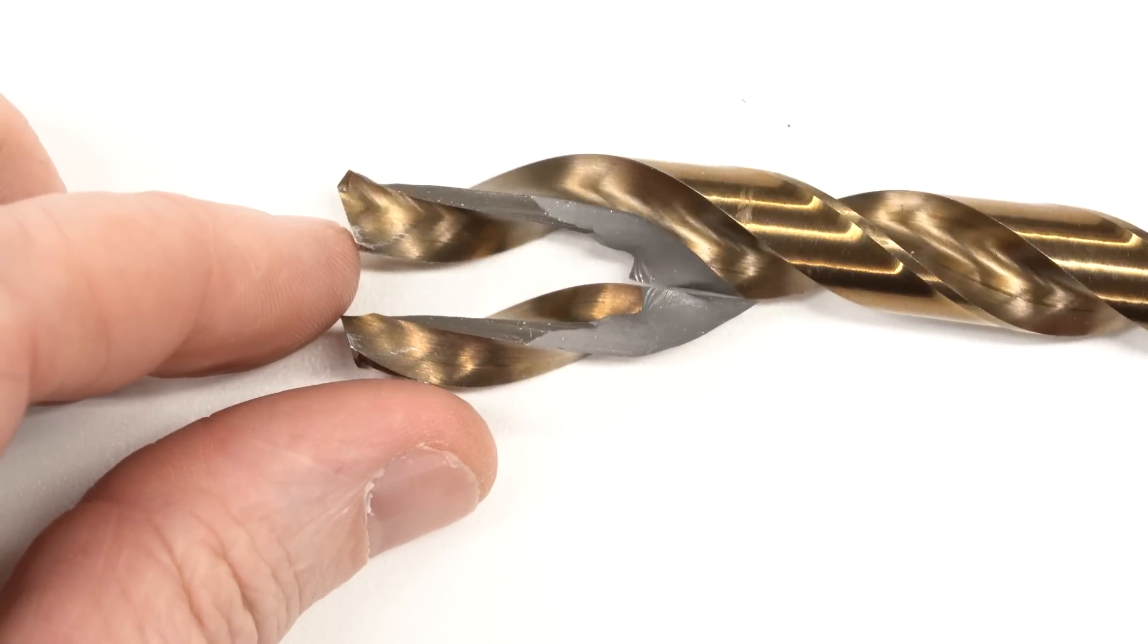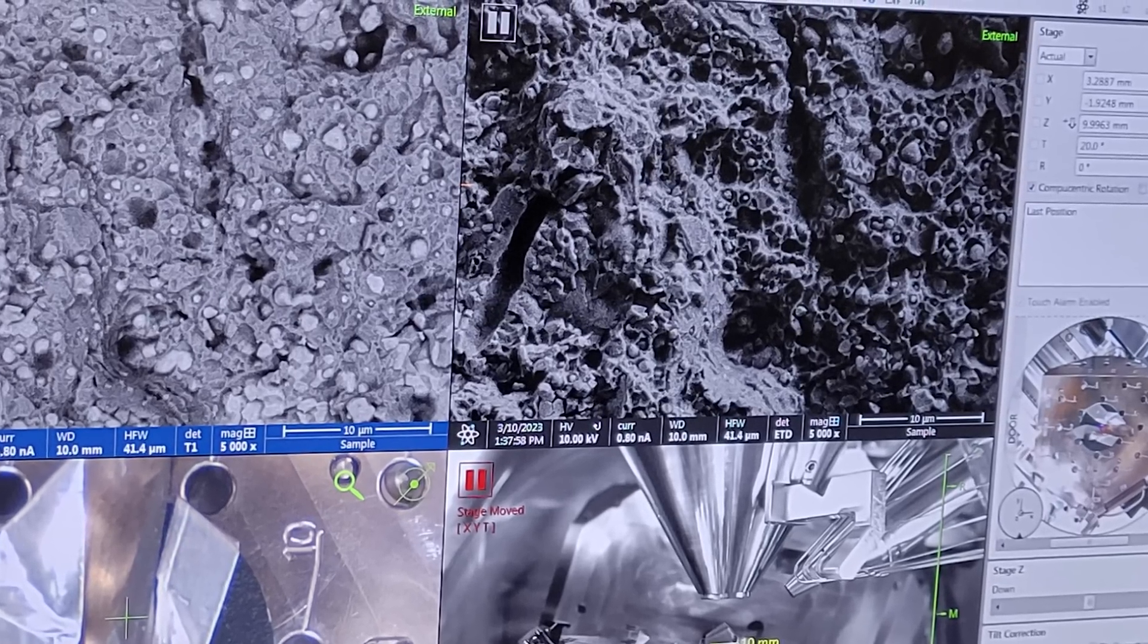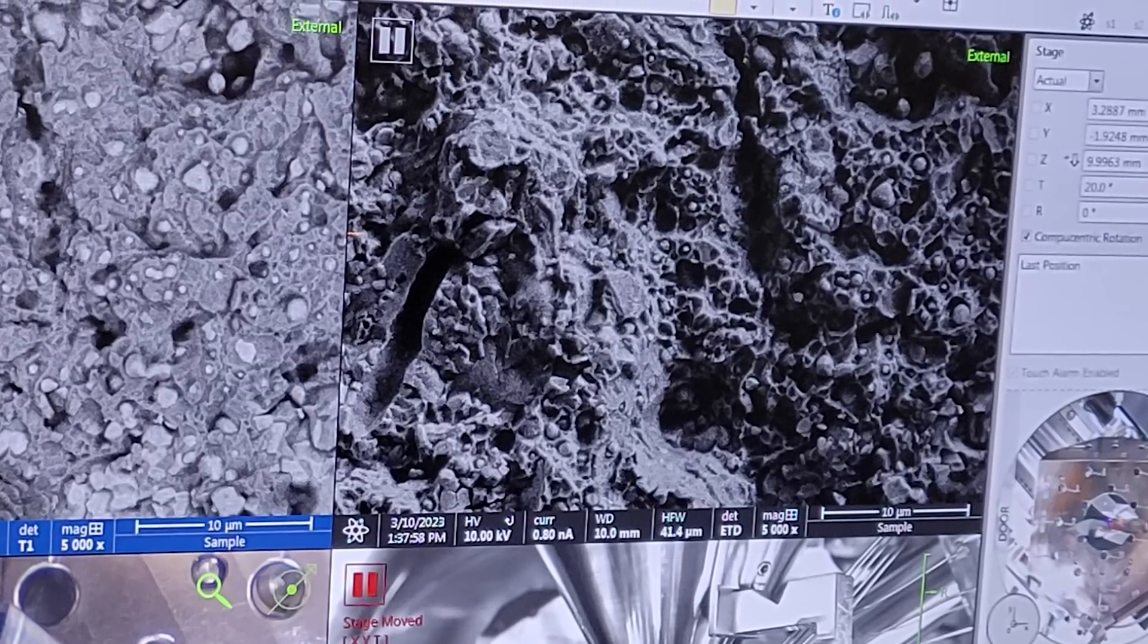If you've ever broken a drill on the lathe and thought what I really need is a scanning electron microscope, well this is the video for you.